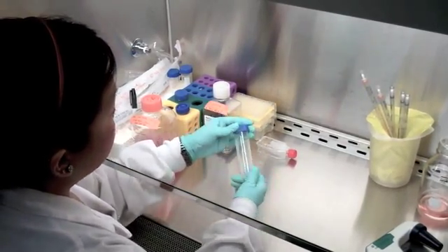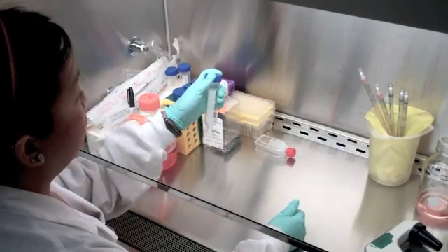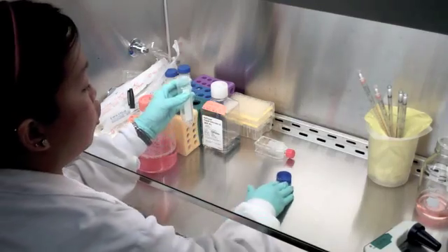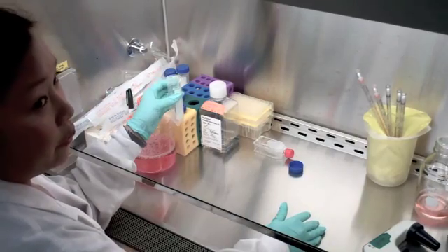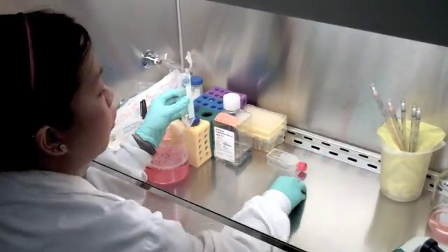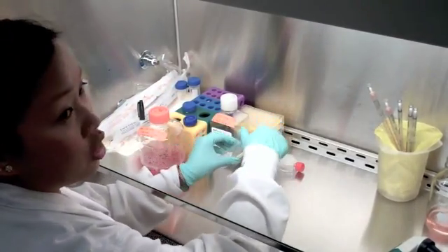Another issue is that it's hard at first to un-cap with just two fingers, like that. It's totally fine if you do it with your other hand, but do it sterile. You can set your cap down and push it to the back so you don't risk having your hand passing over. But whenever students go to take it back and close the tube, they usually grab it so their hand still passes over. So you kind of want to sneak in and go on the side and then close the tube.